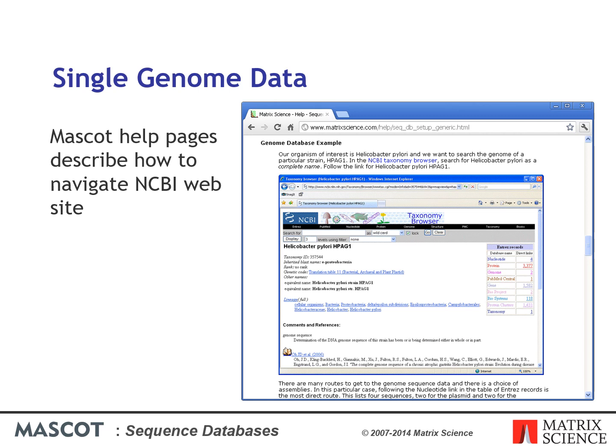All the genomes in GenBank are translated into protein sequences in NCBI-NR. Usually, this is the simplest option for a Mascot search. But if you are not confident that the coding sequences and reading frames have been identified correctly, or if you're looking for something unusual, you might wish to search the genomic DNA directly. The Mascot help page for a generic database describes how to locate and download different types of sequence data, including genomic DNA.